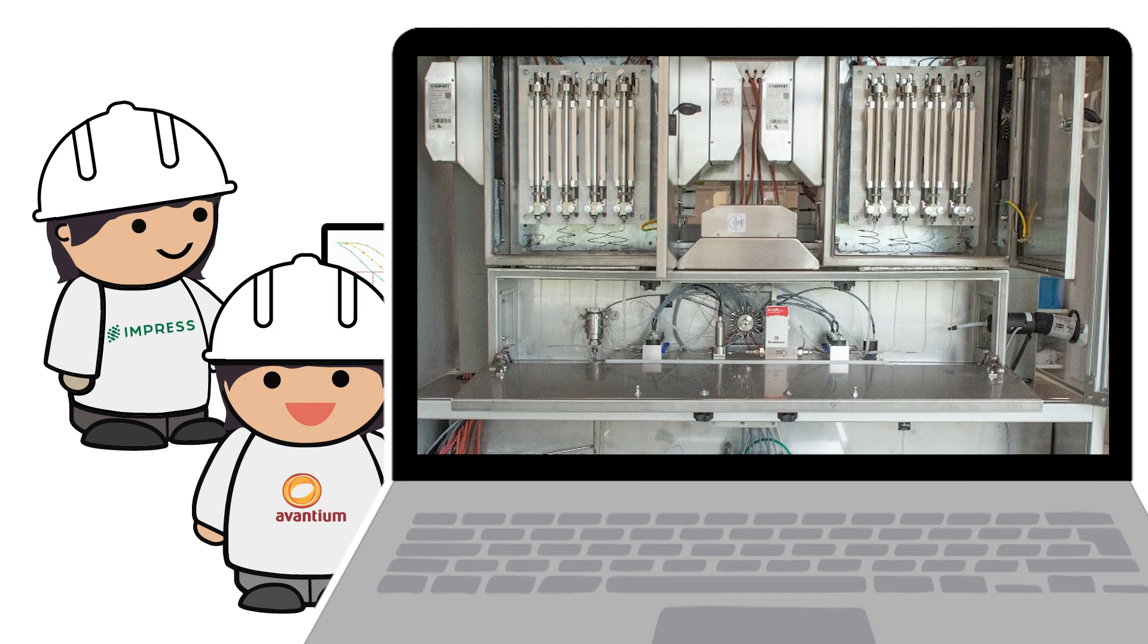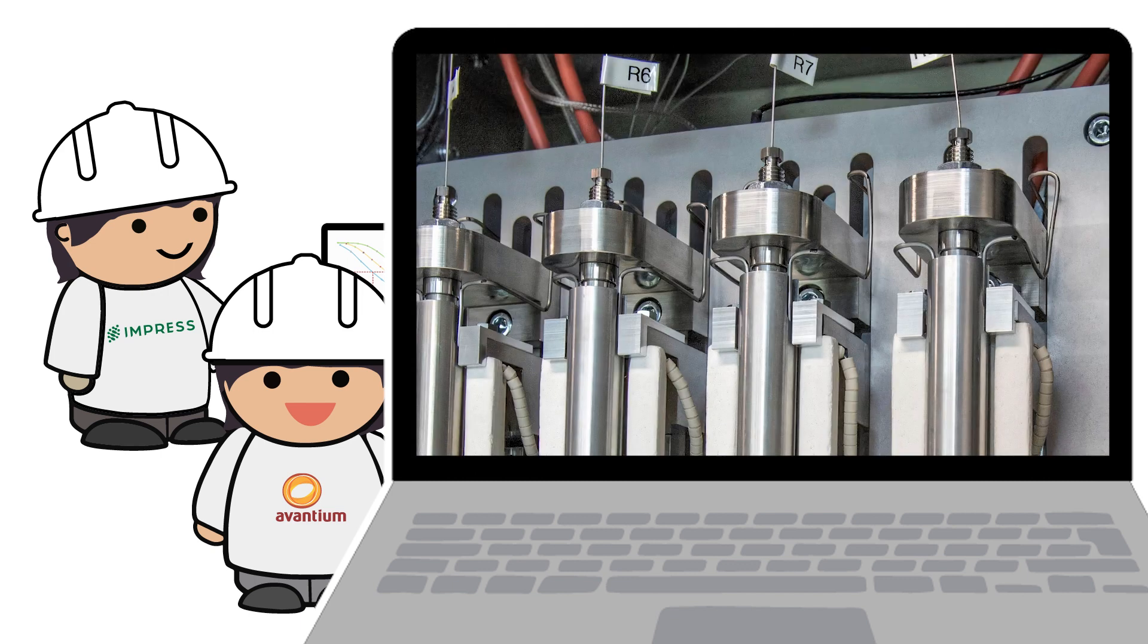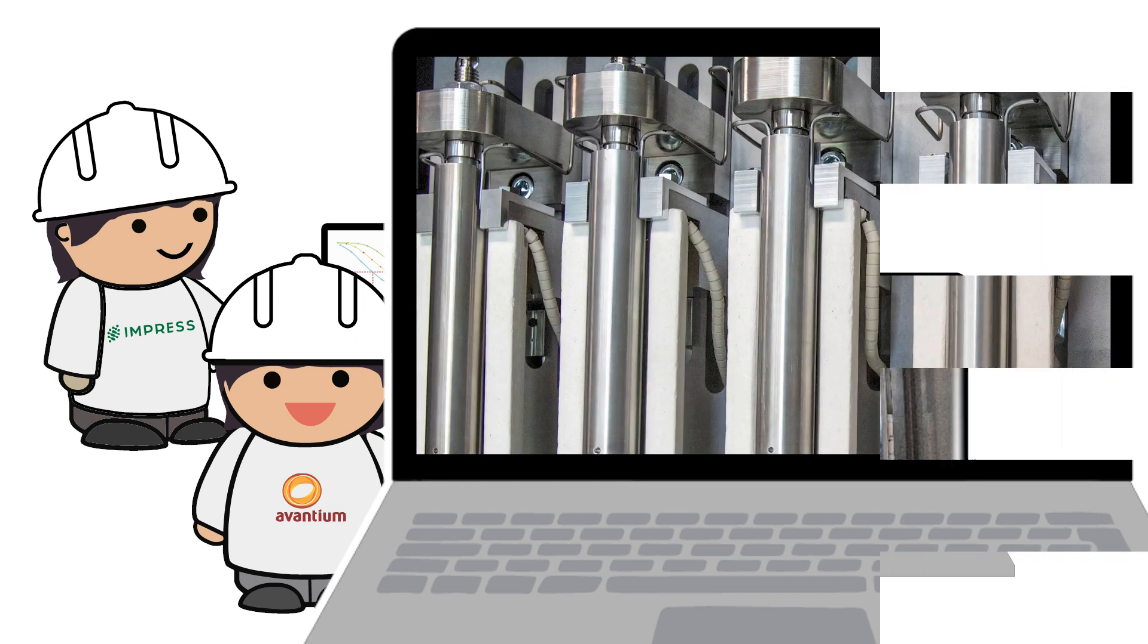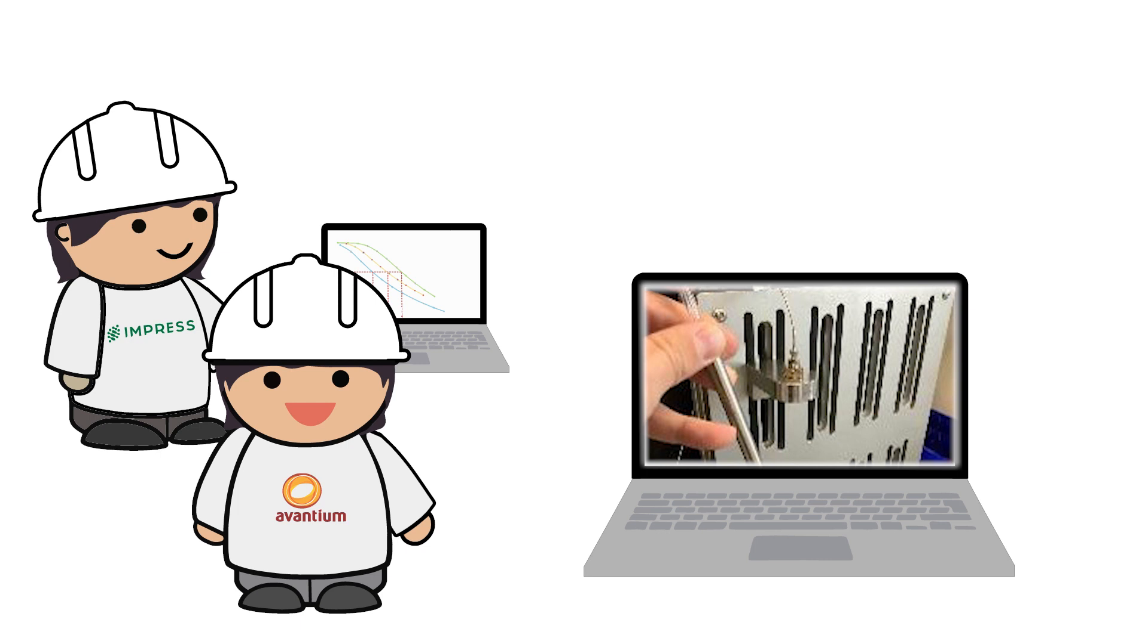With high throughput testing equipment you can perform multiple experiments in parallel, testing different adsorbents and process parameters. Moreover, since the equipment is miniaturized, less chemicals are used and shorter experimental time is needed. It is also easy to replace the columns.